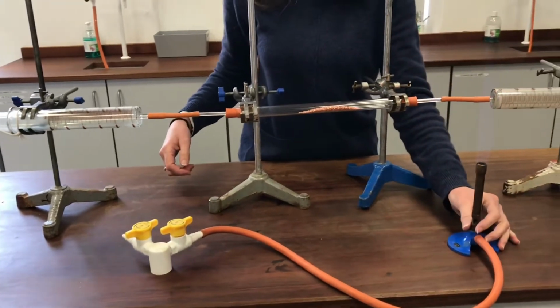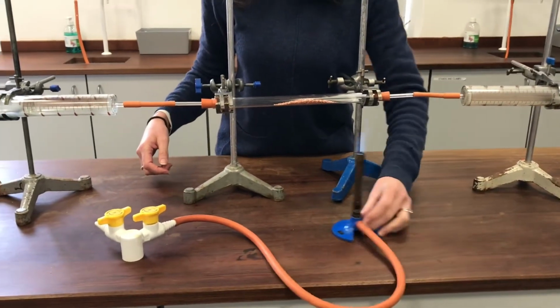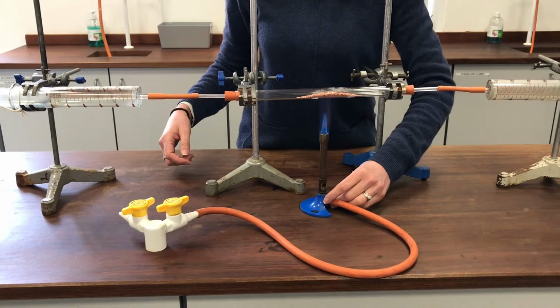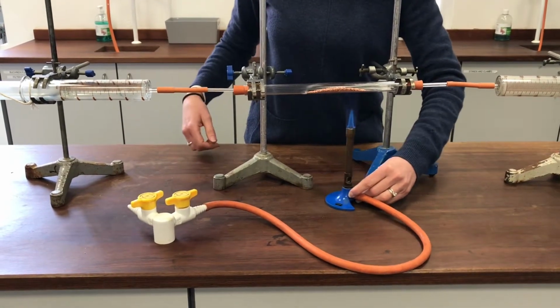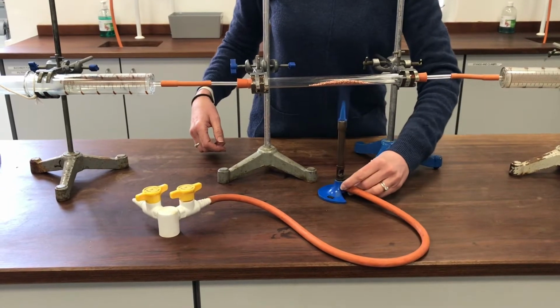Okay, so I'm going to start heating it up now. And you should see that my copper in there will start to go black during the experiment as it forms this copper oxide.